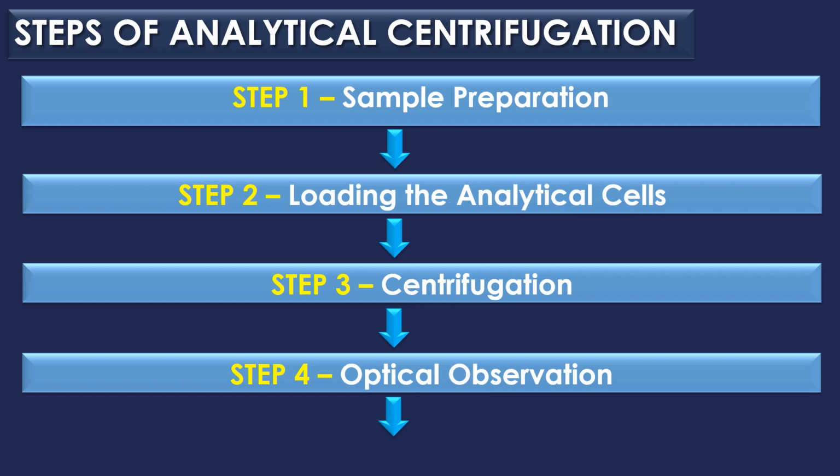Step 2 is loading the analytical cells. The prepared samples are loaded into the analytical cells, which are designed to withstand the high speeds and forces generated during centrifugation. These cells are then carefully positioned inside the ultracentrifuge rotor.